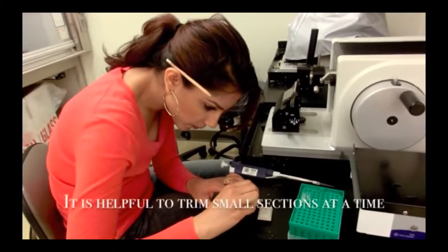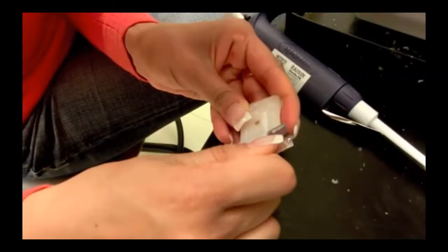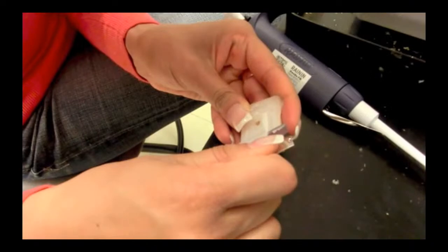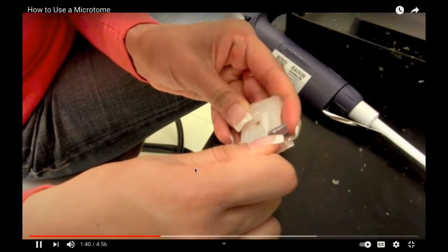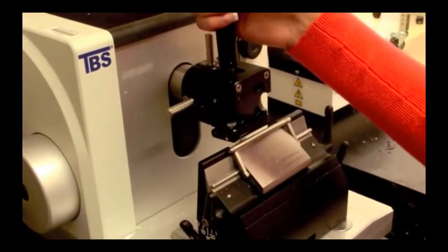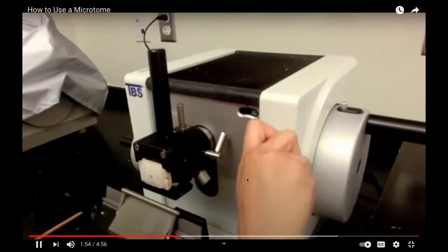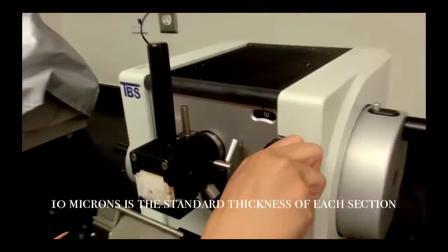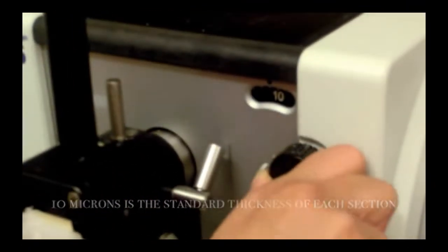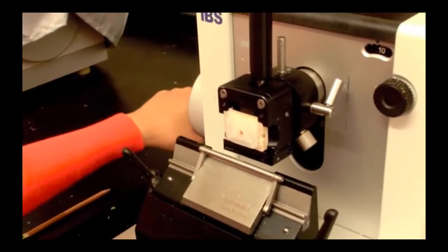This series of steps involves paraffin cartridge preparation. Remove excess wax from the cartridge using a razor blade. Make sure to cut it in a trapezoid shape with the longest edge at the bottom of the cartridge. Be careful not to crack the paraffin. When you are ready to section the paraffin embedded organ, place the paraffin cartridge in the microtome while pulling the main handle towards you. Use the knob on the right to adjust the section thickness required for your sectioning, approximately 10 microns. Next, adjust the stage with the wheel on the left so as to move the paraffin cartridge close to the microtome blade.